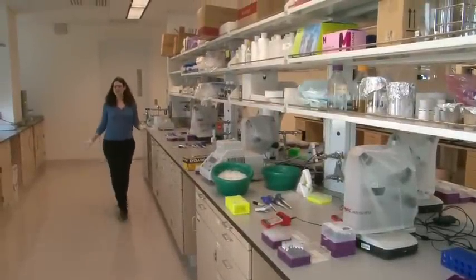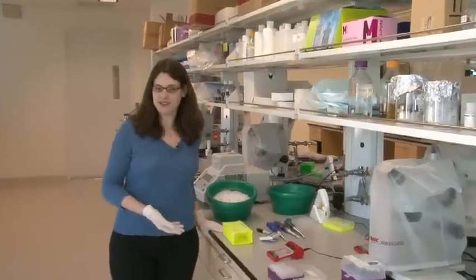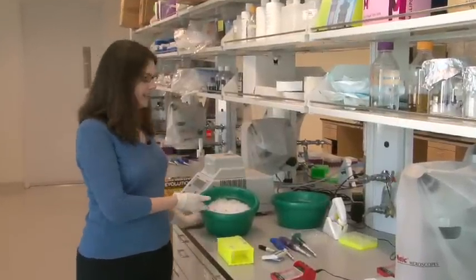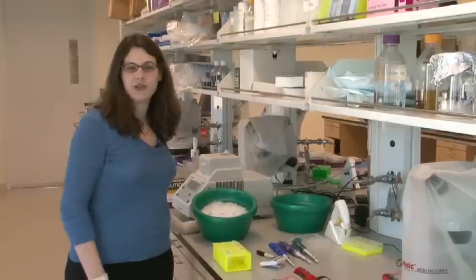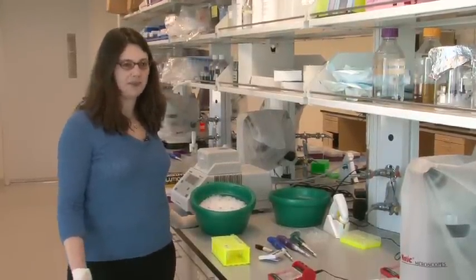Hi, welcome to my lab here at the Broad Institute. I'm going to be showing you how this process works here in lab, and here you can see the equipment that I'll be using to show you how to use gel electrophoresis to identify people based on their DNA.